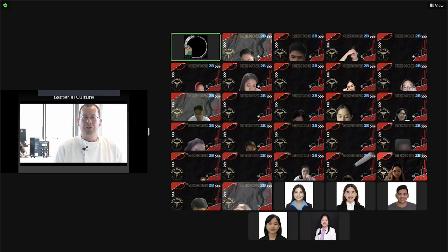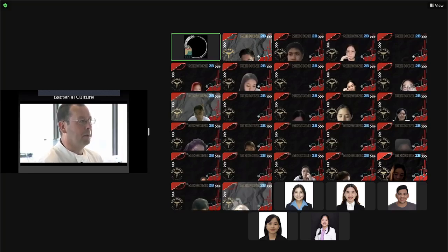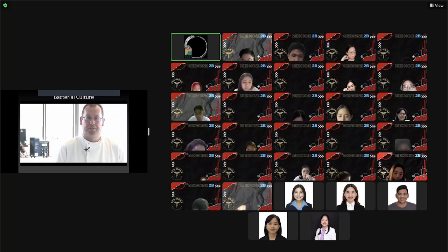So this poses a challenge for microbiologists. How do you find a pathogenic microorganism among the billions of other microorganisms present? It's like looking for a needle in a haystack. And the answer is to use selective media. Selective media contains something which prevents or inhibits the growth of many of the microorganisms which we are not looking for, while allowing the growth of the microorganism we are looking for.